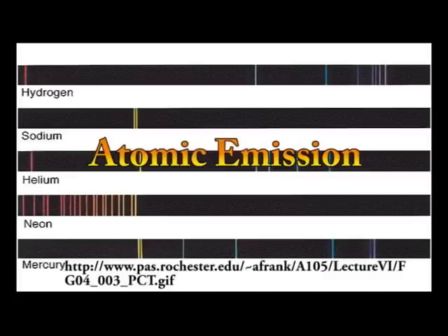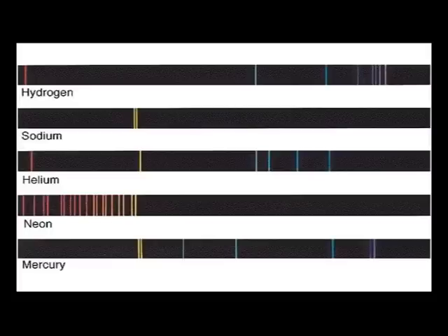In this experiment, you will be determining the identity of an unknown light source based on the emission line spectra of several known substances. The method you will be using is one of the methods scientists use to determine the chemical compositions of things that they cannot directly sample, like stars. Watch the following demonstration carefully and write down the steps to the procedure in as much detail as possible.